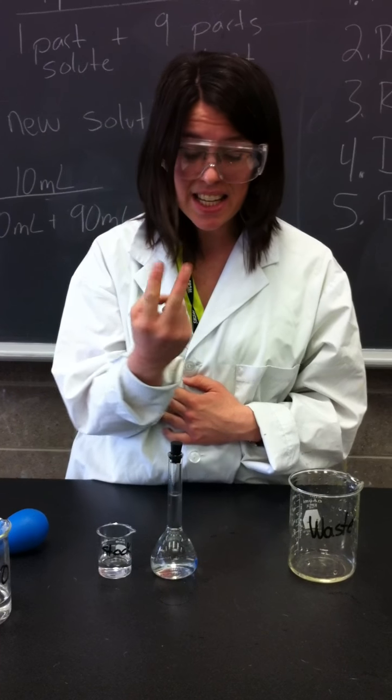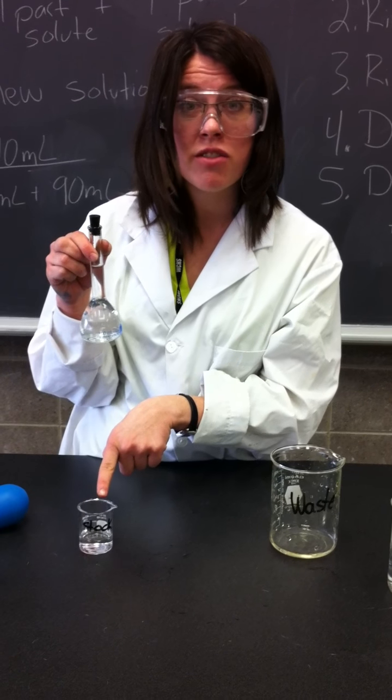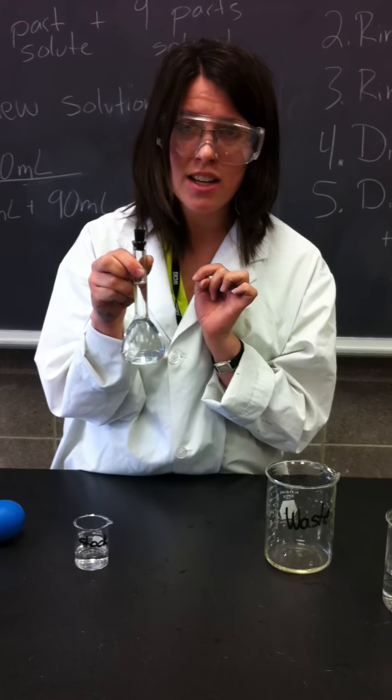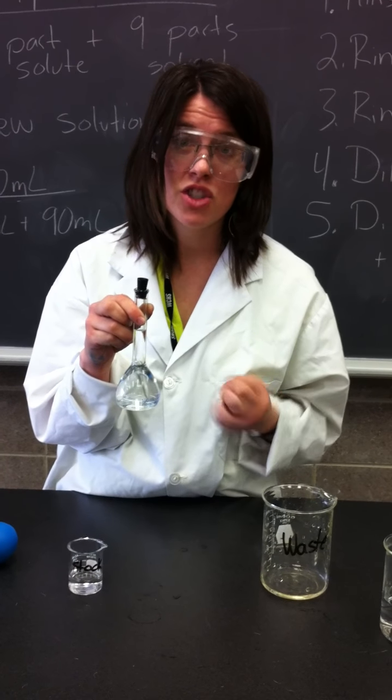So then you're going to do a second dilution. So you're going to test the pH. You need to know the pH of this. You're going to dump some of this into a beaker and test the pH of that. And then you're going to do a second tenfold dilution, just like the first one. Okay? All right, good luck.